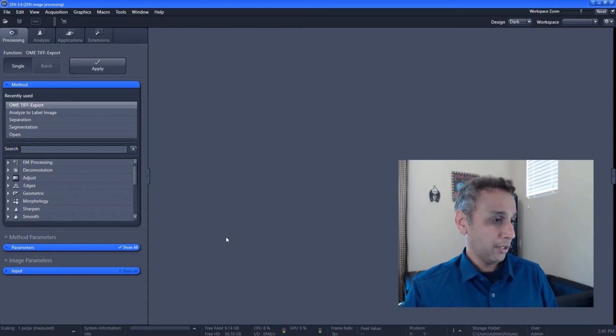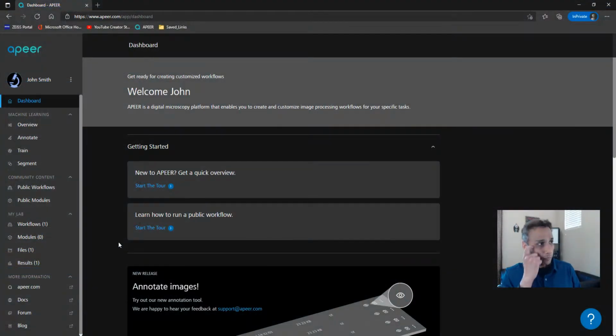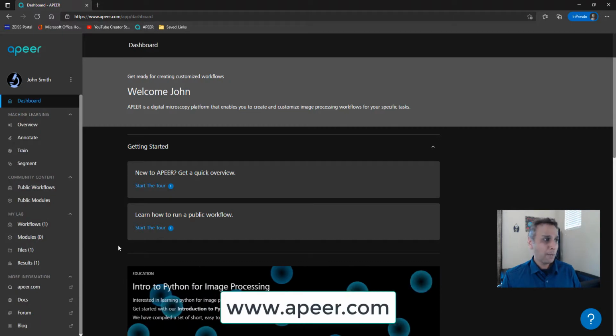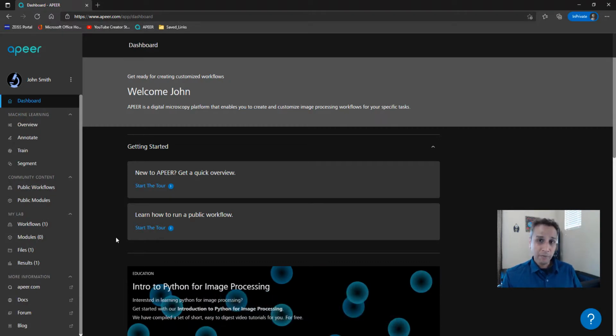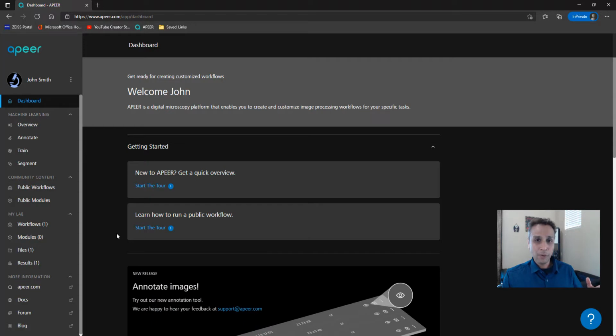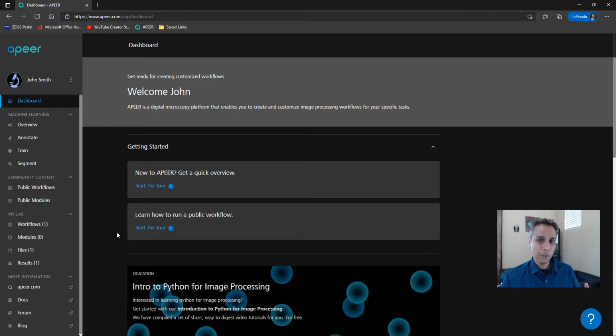So let's open APEER in a browser. You just type www.apeer.com. If you haven't signed up before, go ahead and sign up and log in. And as soon as you log in, if it's your first time, please get familiarized with the platform, because you may find other tools to be useful, not just the tracking module. We have a few other modules and you may find them to be useful.